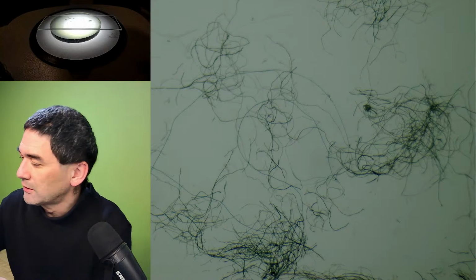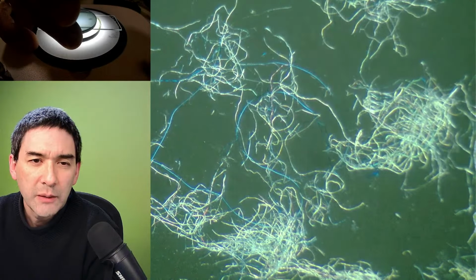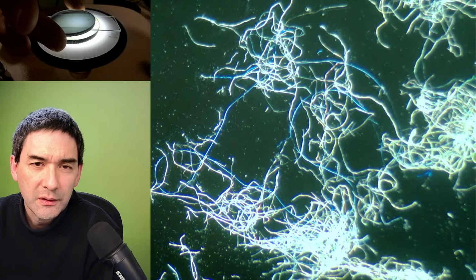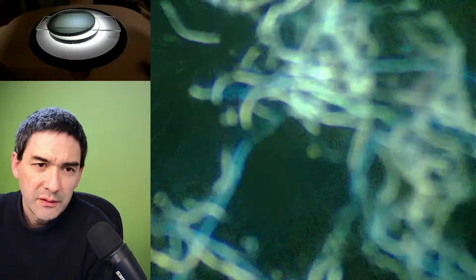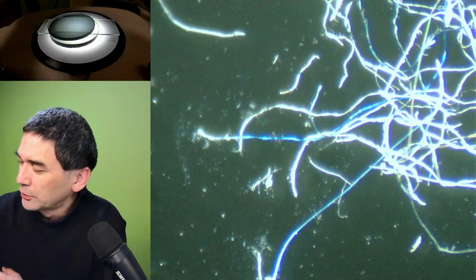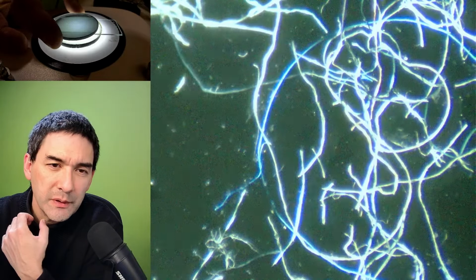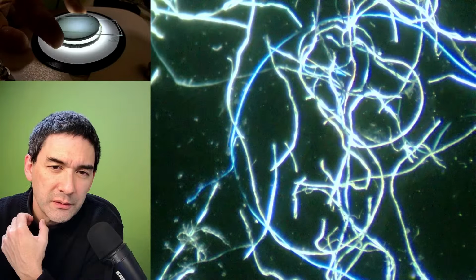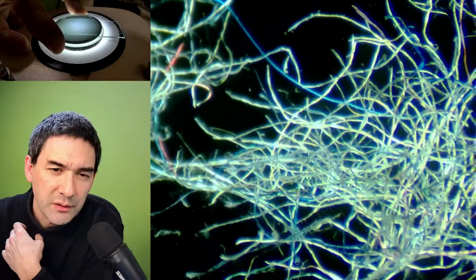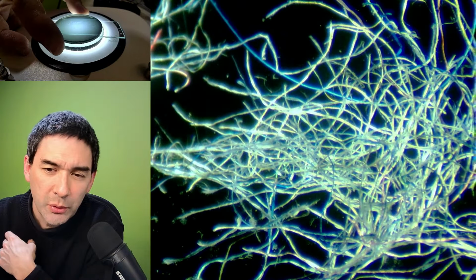So let's do it again on the cross-polarized. Okay, you know what, I'm just going to drop it directly on here. Look at this. You see, that's a little bit of a problem with the camera, which adjusts the exposure, so they look a little bit overexposed. But we can already maybe identify that some of them actually do change color in the polarized light.